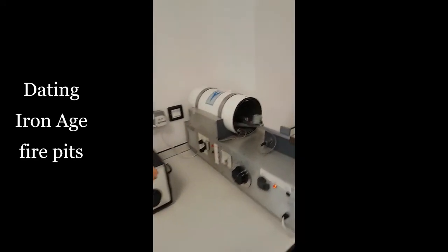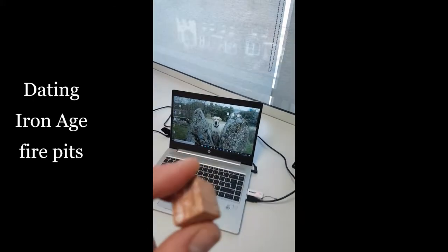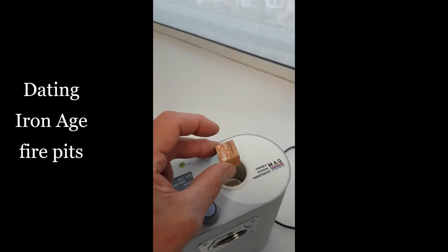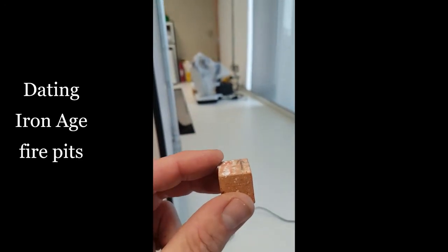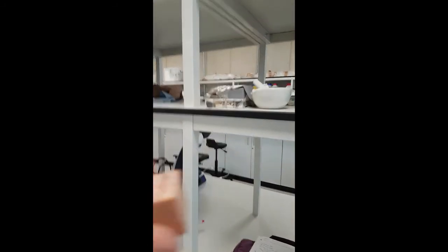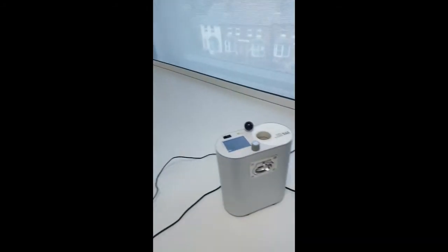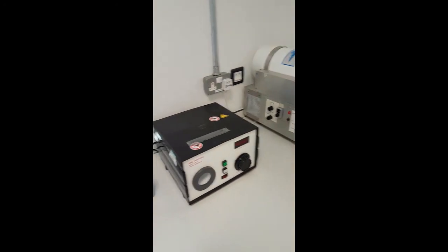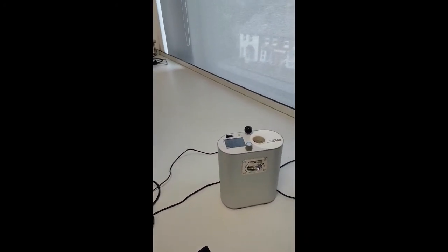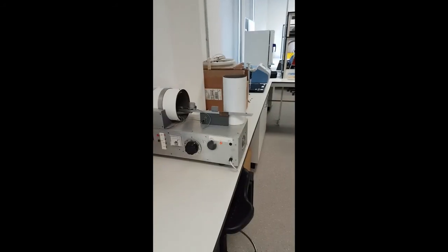We take our samples, we go to our demagnetizer, and we progressively demagnetize the samples. Each time we demagnetize them, we measure what's left of the magnetic memory using our magnetometer. And then once we've completely demagnetized them, we can figure out that bit of the magnetic memory that's associated with the last time that they cooled down. And that bit of the magnetic memory we can use to tell us when that happened. All because of a magnetometer, a demagnetizer, a susceptometer, an impulse magnetizer, a bit of science, and a bit of imagination. Pretty cool, right? All you need is an interesting scientific question that involves magnetism, and we have the laboratory to help you answer that question.